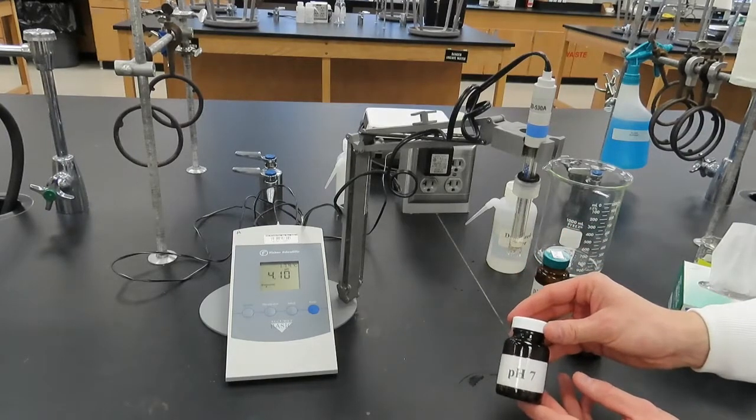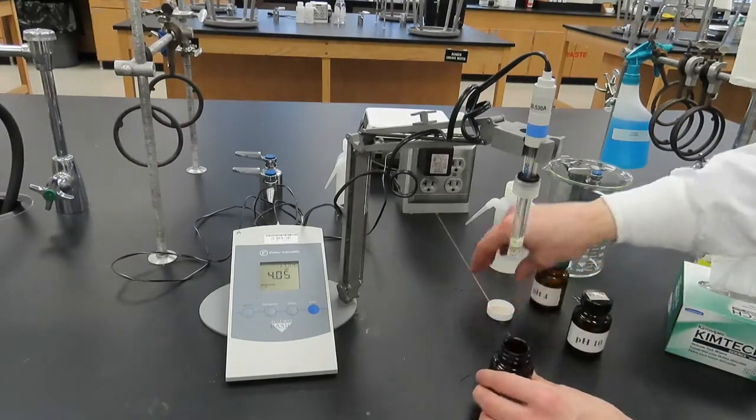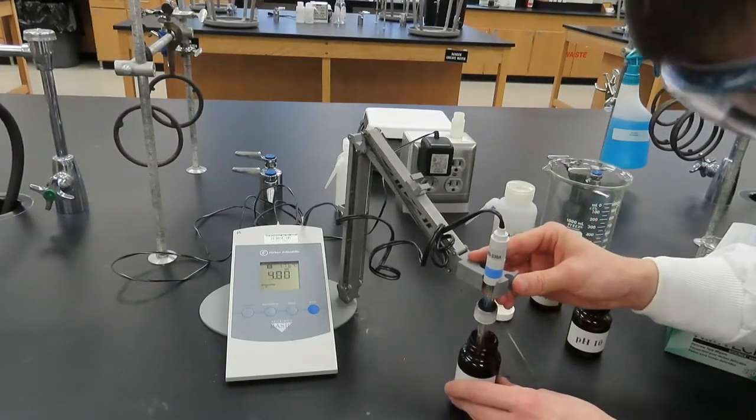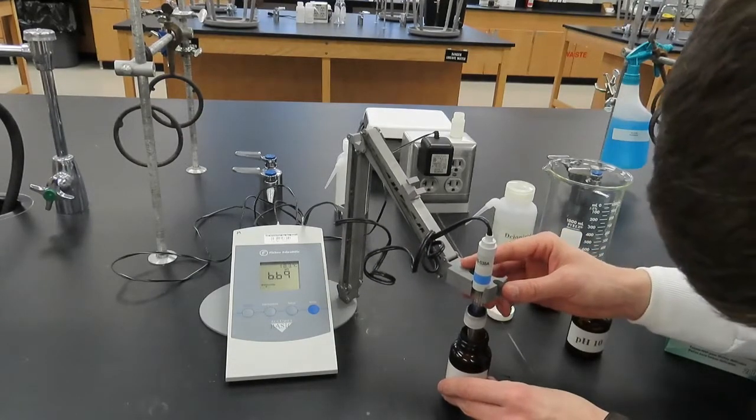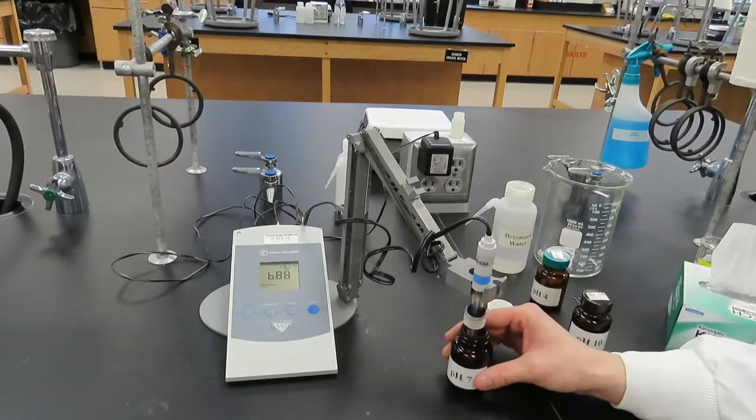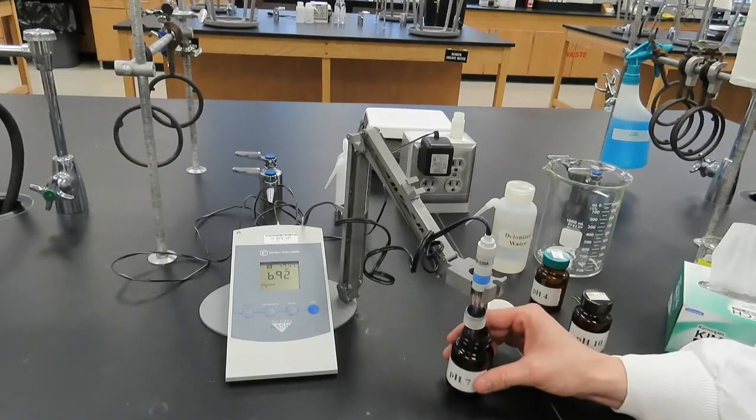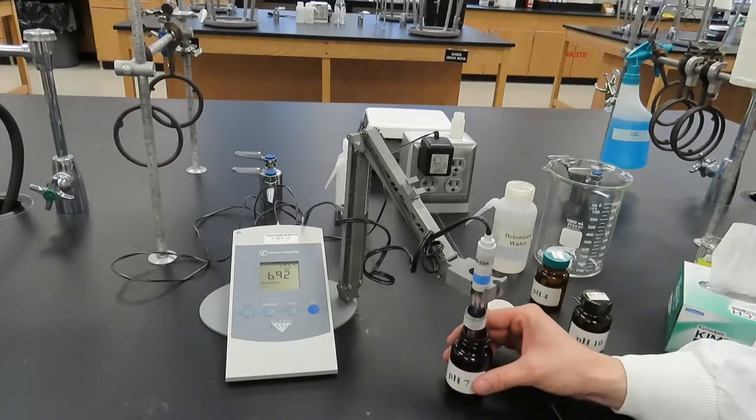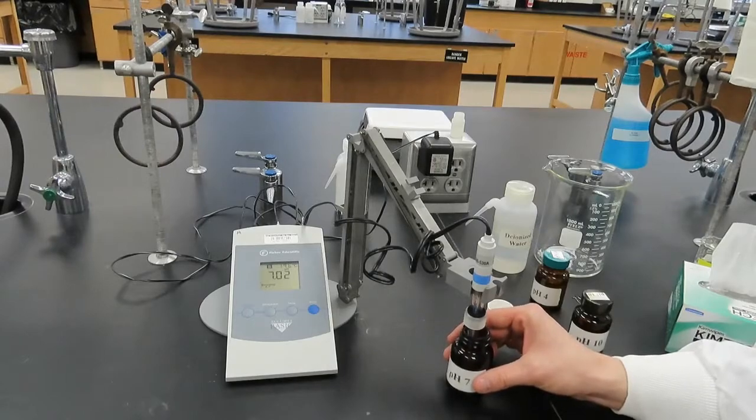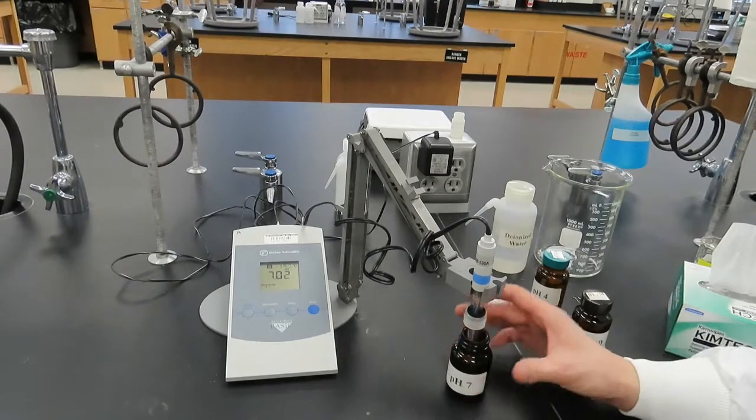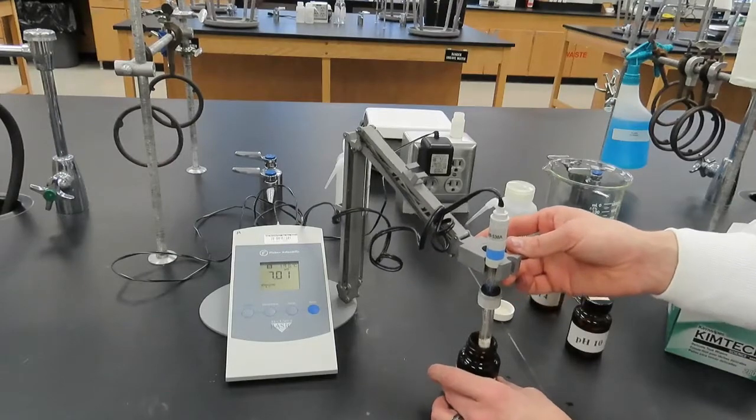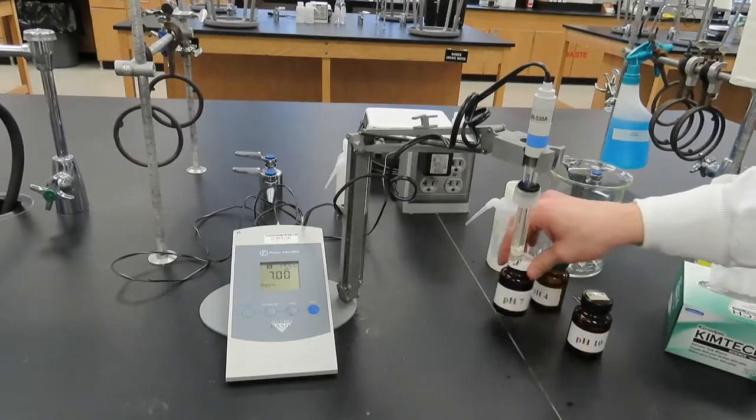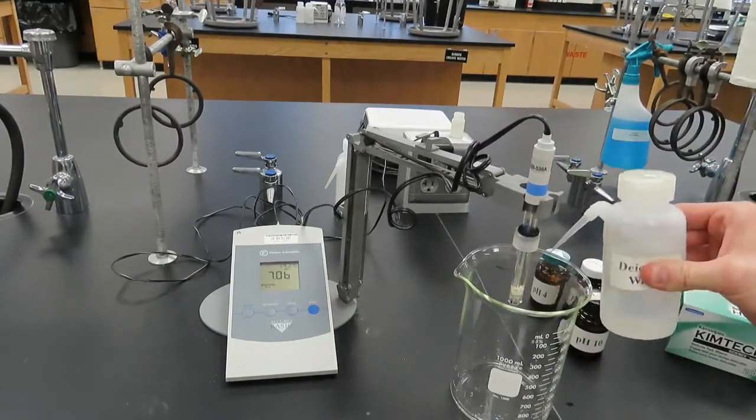Secondly, we will repeat the same process with a buffer solution of pH 7. When the pH value stabilizes, press the Standardize button while continuing to swirl the pH 7 buffer solution. Remove the electrode from the pH 7 buffer solution, rinse, and dry it.